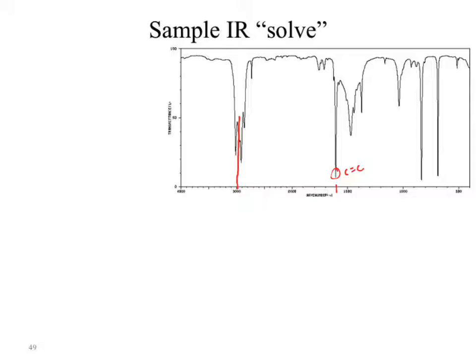It's low because there's resonance and the double bond has been weakened. It would get weakened because that carbon-carbon double bond is showing up in an aromatic benzene. What evidence do I have? I have another sequence of peaks a little bit lower down. That, in conjunction, helps me to say that more than likely I have an aromatic ring.